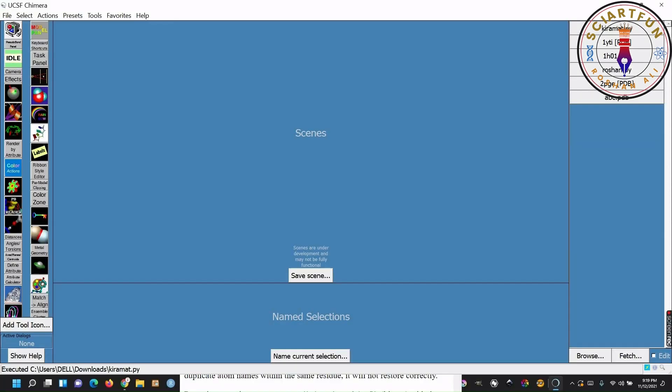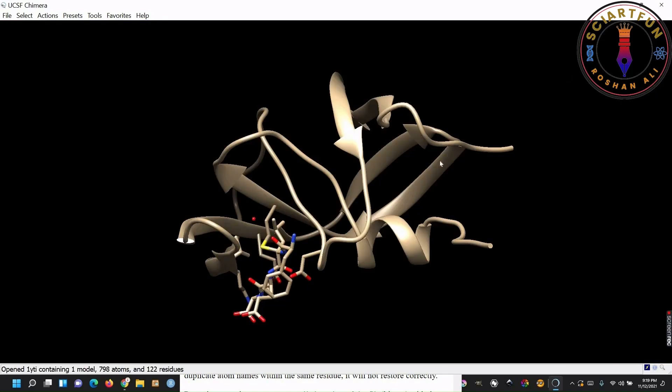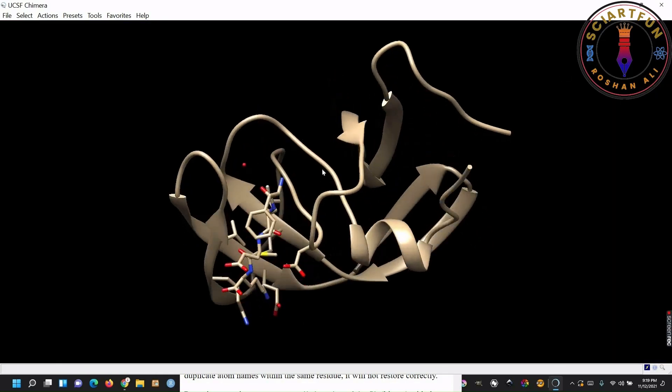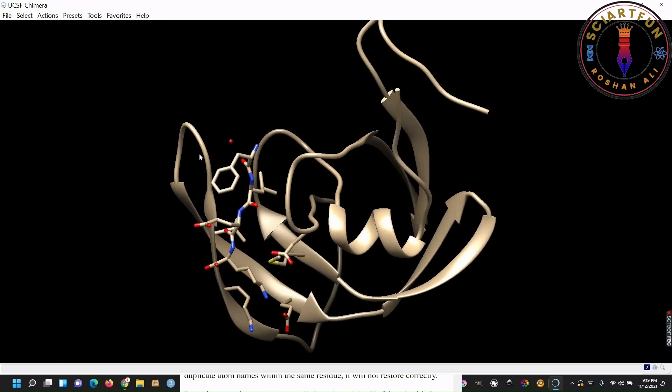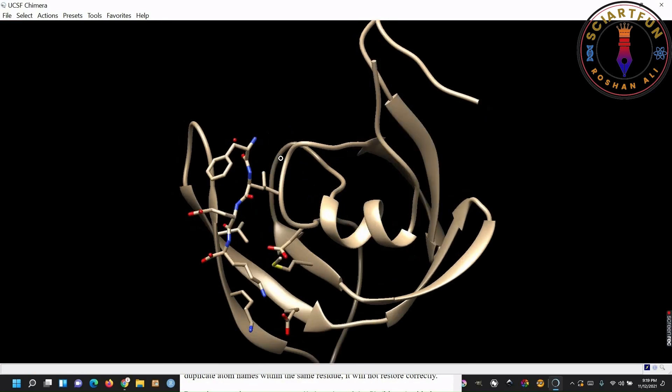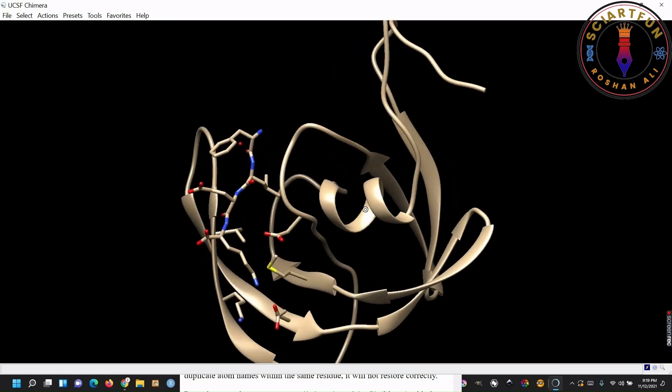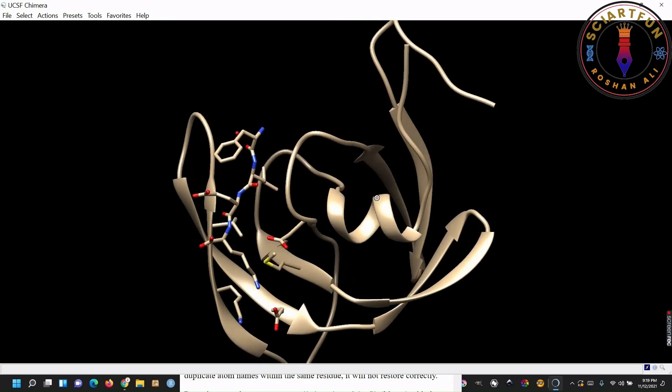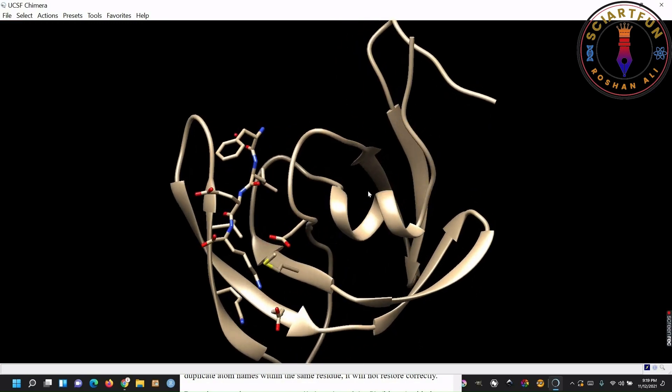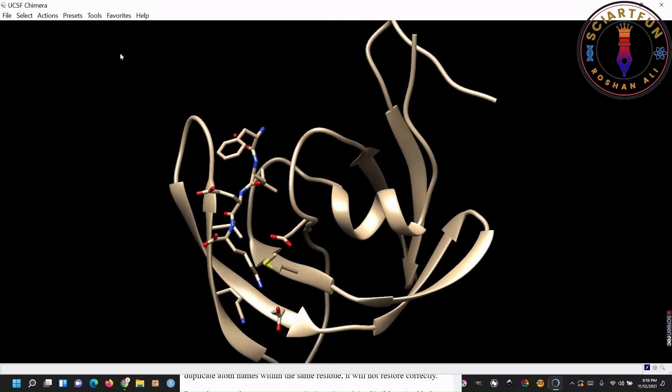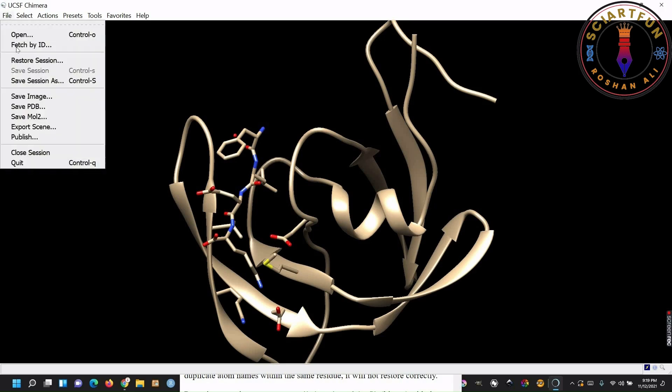If you want to save the image of your structure, for publication etc., then first rotate the structure to the proper view. Set the image in your desired color. There are other options that you need to do before producing a publication quality image, but in today's tutorial I am not going into details about that. Those things will be taught in the coming lessons, inshallah. After setting all options, go to file, click save image.